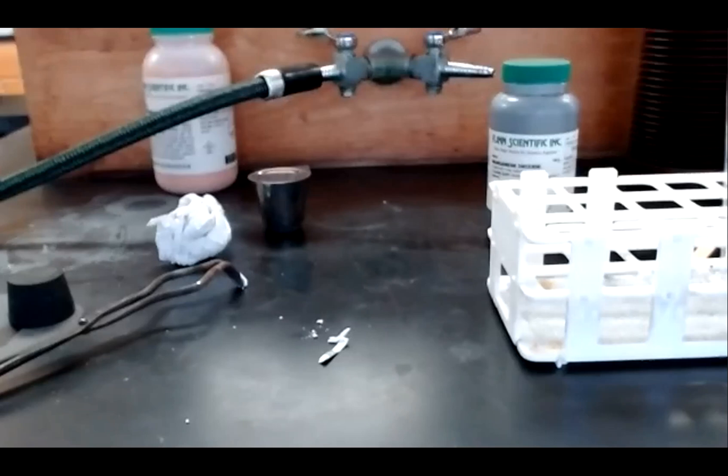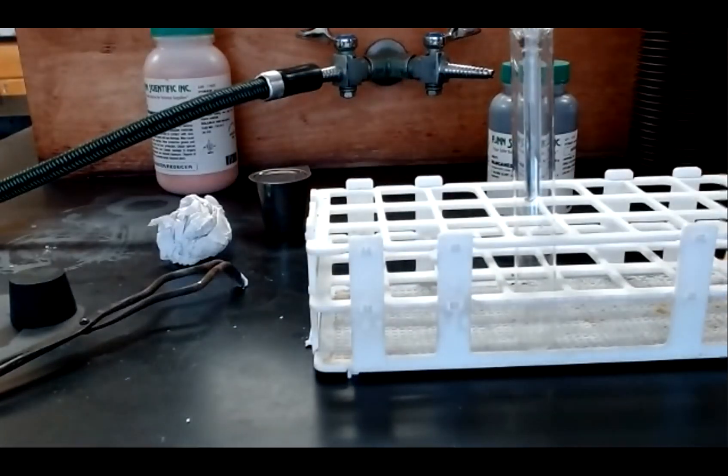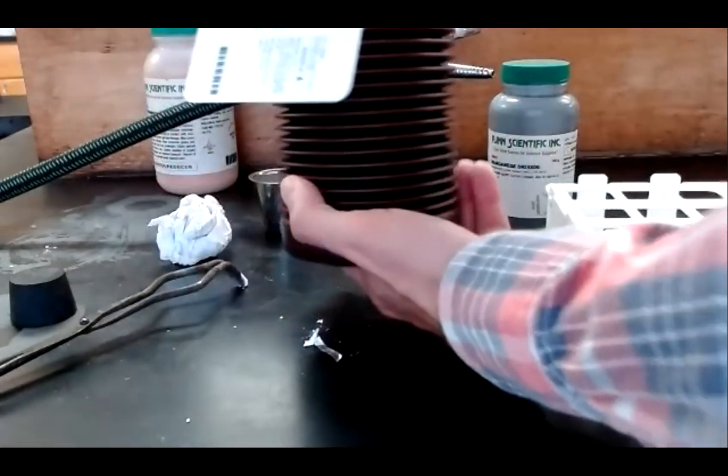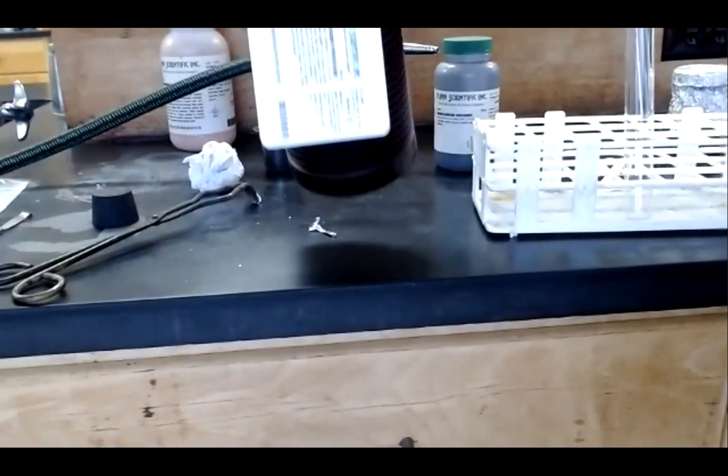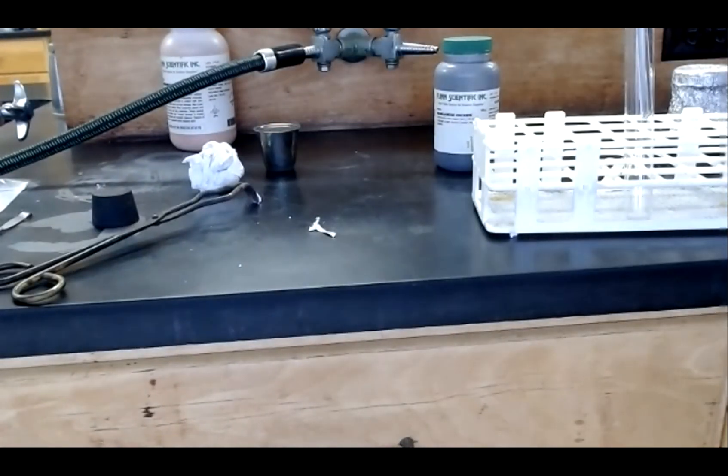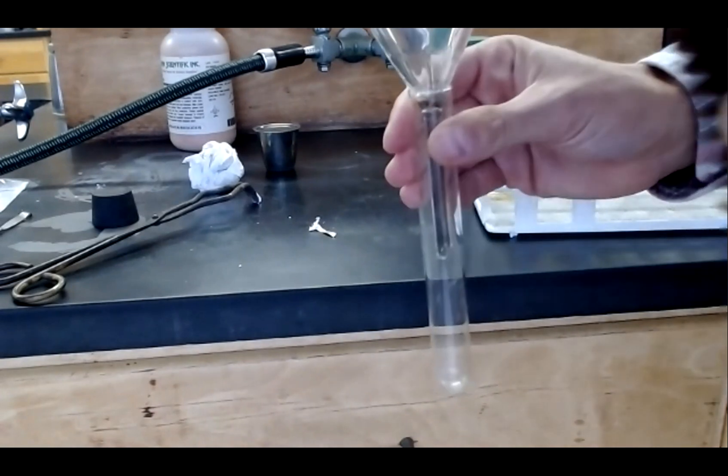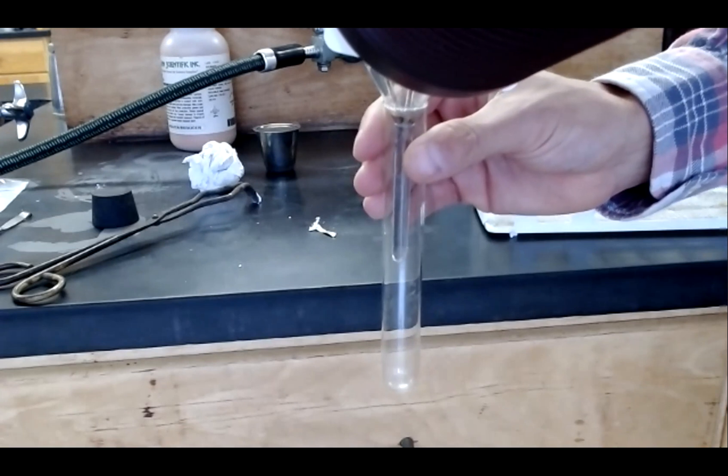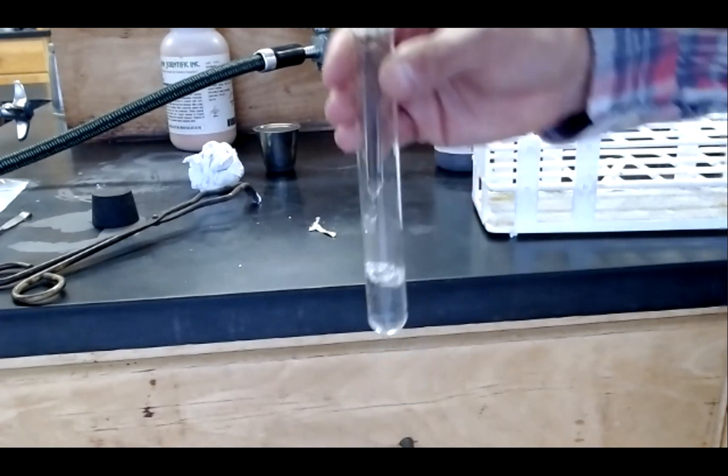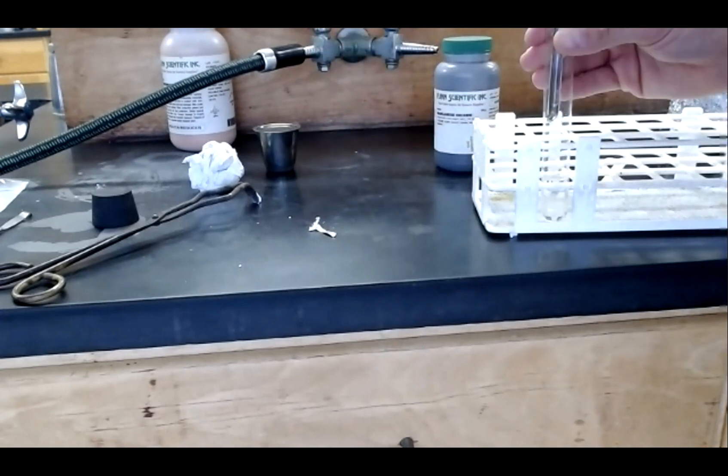The next reaction I'll show you is the decomposition of hydrogen peroxide. Hydrogen peroxide will break down into water and into oxygen gas. To carry out this reaction, I'm going to mix a small amount of concentrated hydrogen peroxide. This is about 30% hydrogen peroxide, which is somewhere around 10 times stronger than what you would typically buy. I'm going to mix that into a test tube.